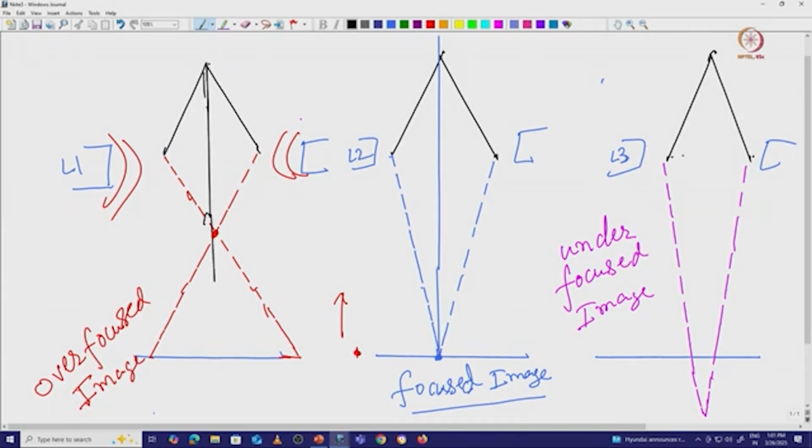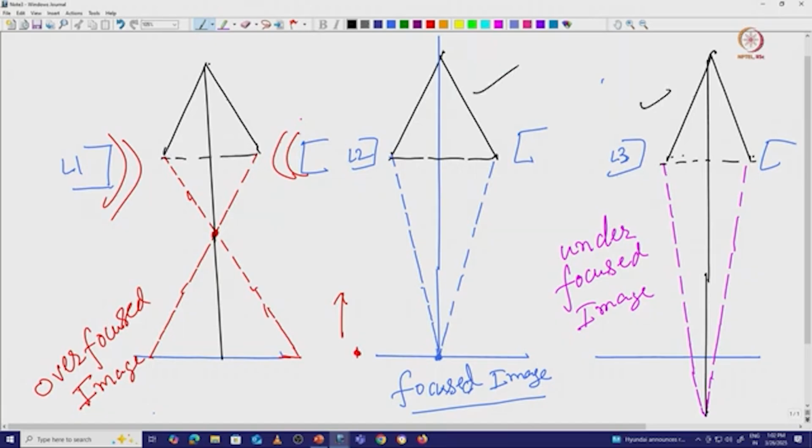So, this is basically the optical axis. Here also, if we just consider, this is our optical axis where the image formation is there. It will be a straight line where you can see how the image formation is. Now, if you look at this particular position, in all the cases until here the beams are behaving in the same way, they have the same angle. Then using this different magnetic field, basically we are converging the electron beam at different positions.